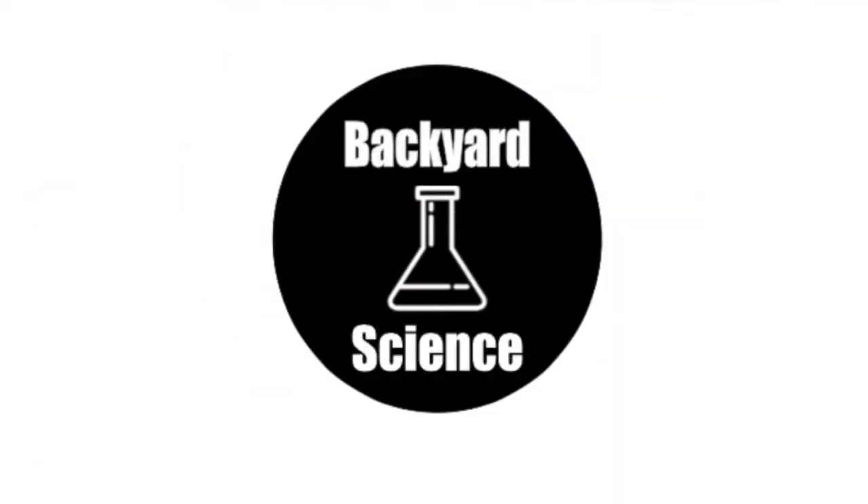Welcome back to Backyard Science! Hey guys, it's Backyard Science here and today we're going to be doing a little classic reaction.